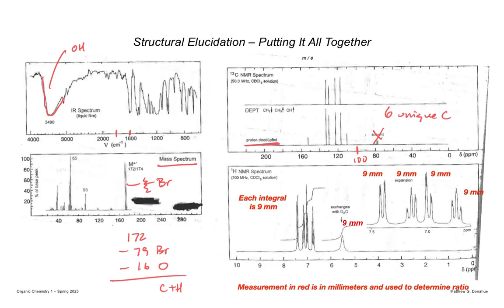So based on the region they're in, if they're sp2, there's no carbonyl, right? Because we know that from the IR. You also know by looking down here, you don't see any signals. So there's no carbonyl sp2 hybridized carbons. So therefore, what functional group do these have to belong to?